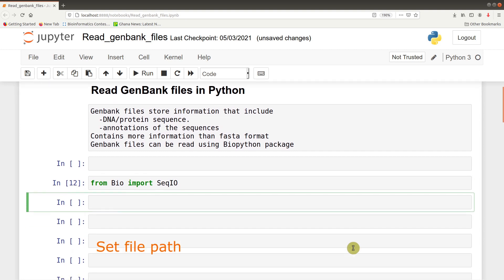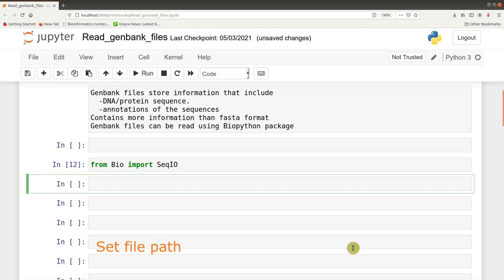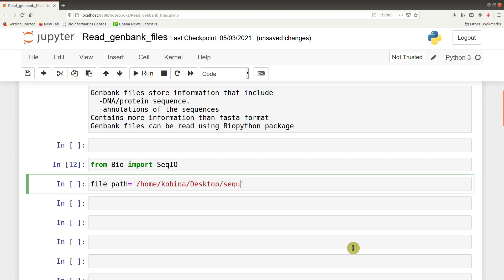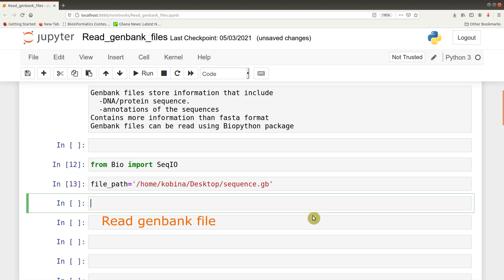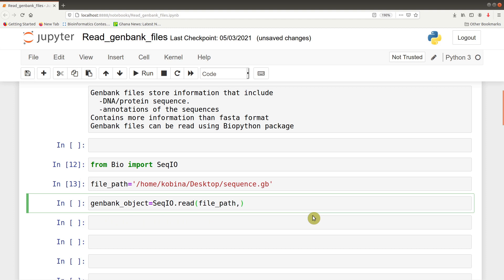The next step is to set a file path — Python needs to know where the file is located. So we set: file_path = '/path/to/your/file/sequence.gb'. Please note that your file path will likely be different from mine, so put the correct one. After setting the path, it's time to read the GenBank file and assign it to a variable: genbank_object = SeqIO.read(file_path, 'genbank').